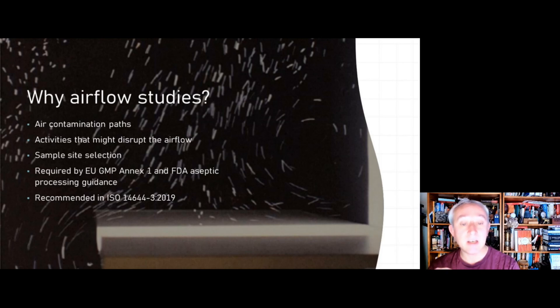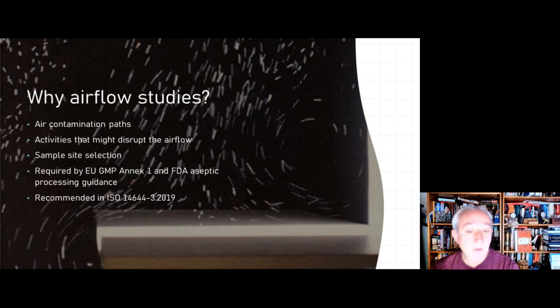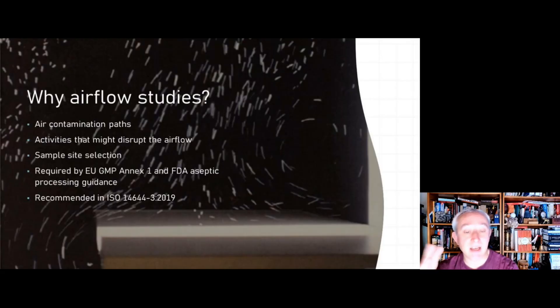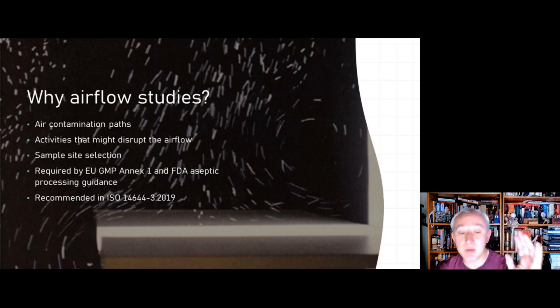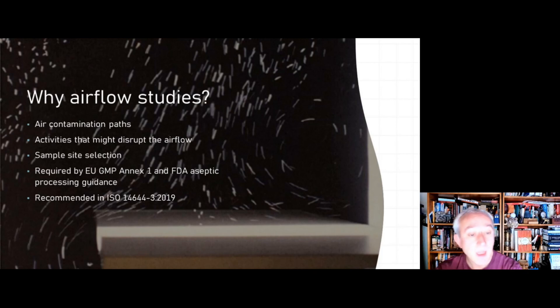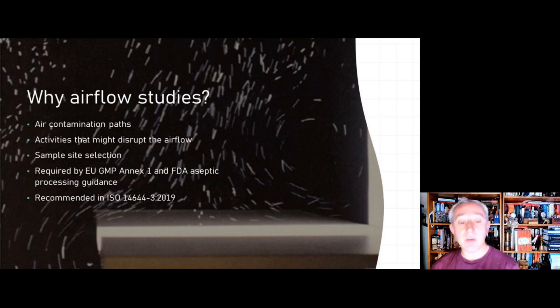Airflow studies can also be a recommendation of the international cleanroom standard ISO 14644 Part 3. The studies can demonstrate quite a lot of information relating to contamination control — assessing where airflows are drawing potentially contaminated air towards the critical zone, or whether objects in the air stream can cause contamination by forcing air to change direction or to circulate.